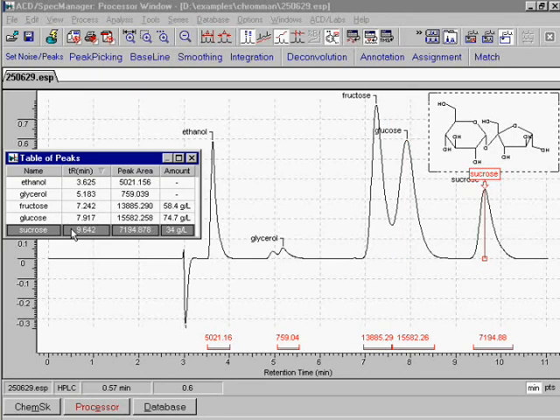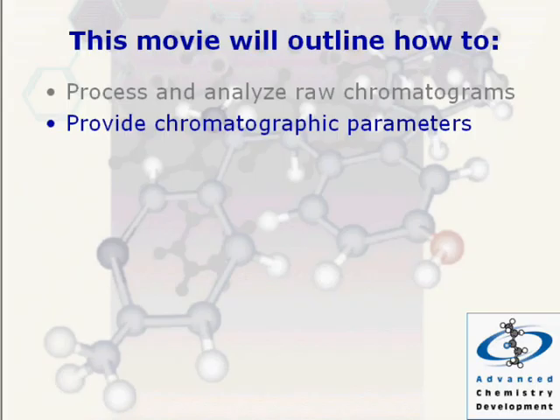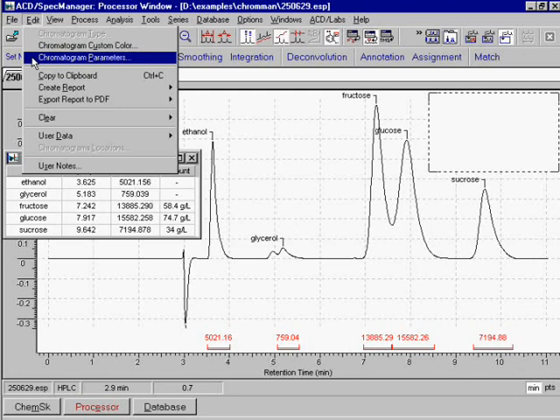Your processed chromatogram can contain a full set of relevant chromatographic parameters. To a spectral document containing the processed chromatogram, you can add information on the experimental conditions in which the chromatogram was obtained.